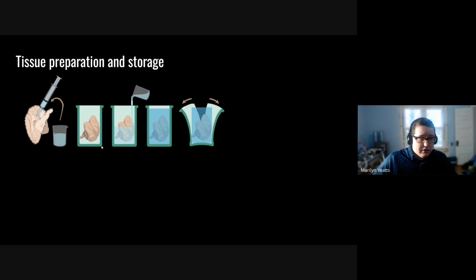But carrying on, after we've gotten the injection into the large sulci, into large gaps in the tissue, we will then place it into a mold that we've custom made such that it will hold the brain in the desired slicing position. So this example shows it in the coronal position to make sure that we're going to have a nice flat bottom that we can then attach to the plunger in the next step. After we put it in the mold, we pour more liquid agar gel over it so that it will set in this position. And once it's set, we demold it.